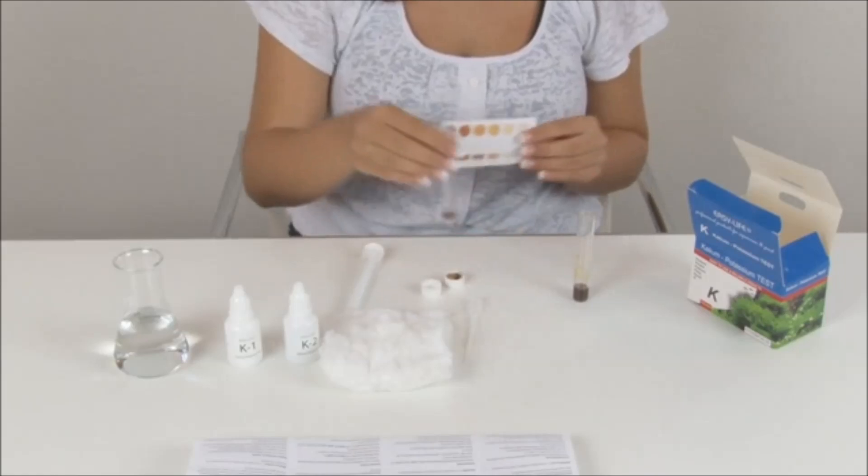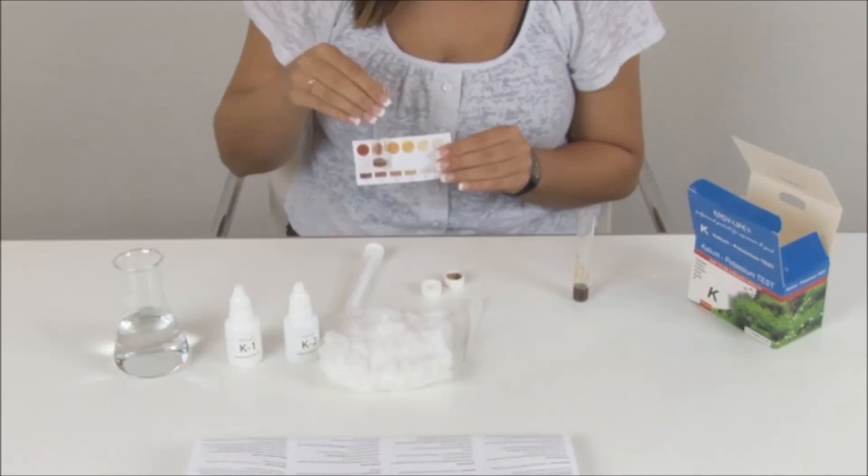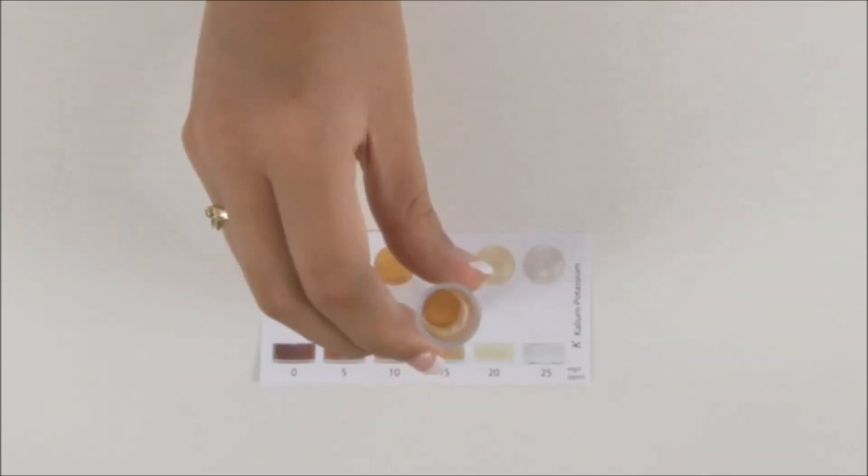There are two ways to compare the color of the liquid: hold the tube against the color chart, and/or watch it from above.